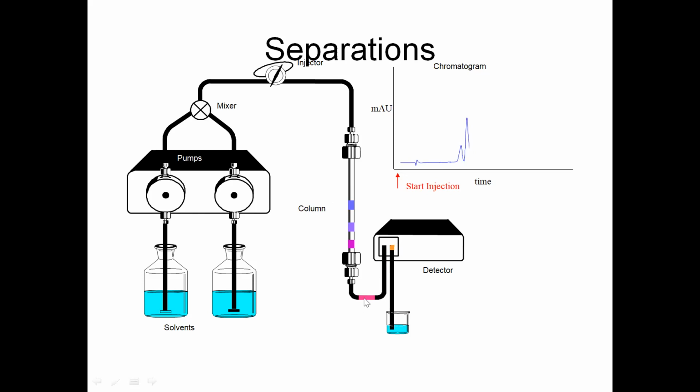Now the third compound is coming, but now you see the distance. The distance between the first and second compound is very less, right? So you see that the two peaks, they are separated, but the separation is okay. It's not bad, but it is okay.